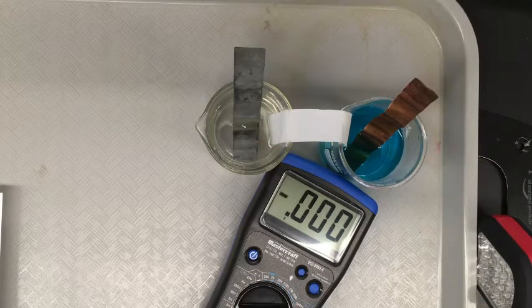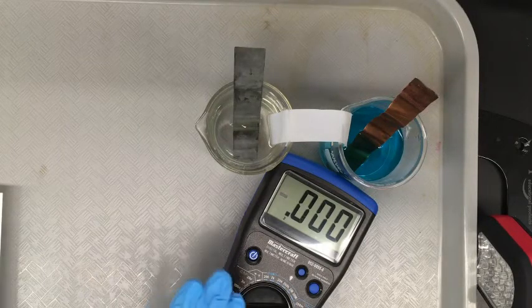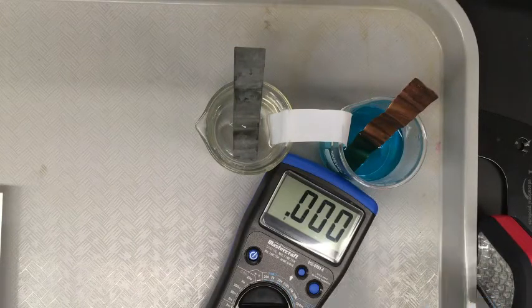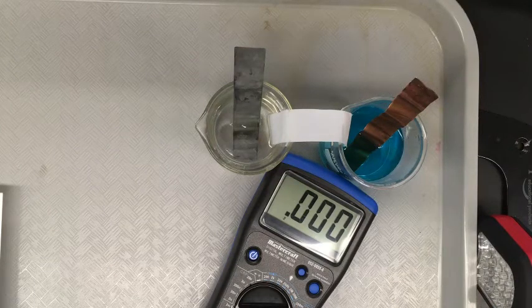And so what happens is electrons will flow through this circuit, from the negative electrode to the positive electrode and back. And the ions will move by way of the salt bridge. So for us, in our original voltaic cell, we'll set up a zinc solution on the left with a zinc electrode. And on the right, we have a copper solution with a copper electrode. And these are both 0.2 molar solutions.